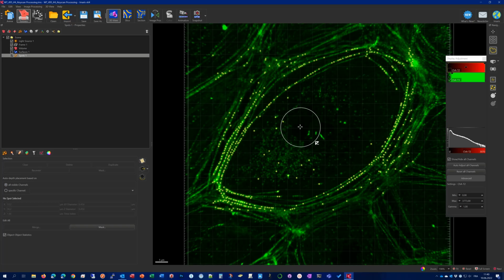It's quite, let's say, biased obviously, because I will have to make some decisions at some point. Do I want to keep this unconnected line to define my innermost circle, or do I want to use those instead? There are some decisions that I will have to make. So sadly there is nothing you can do against that. So I will speed up, or maybe just cut the video here, because it will probably take a long time.